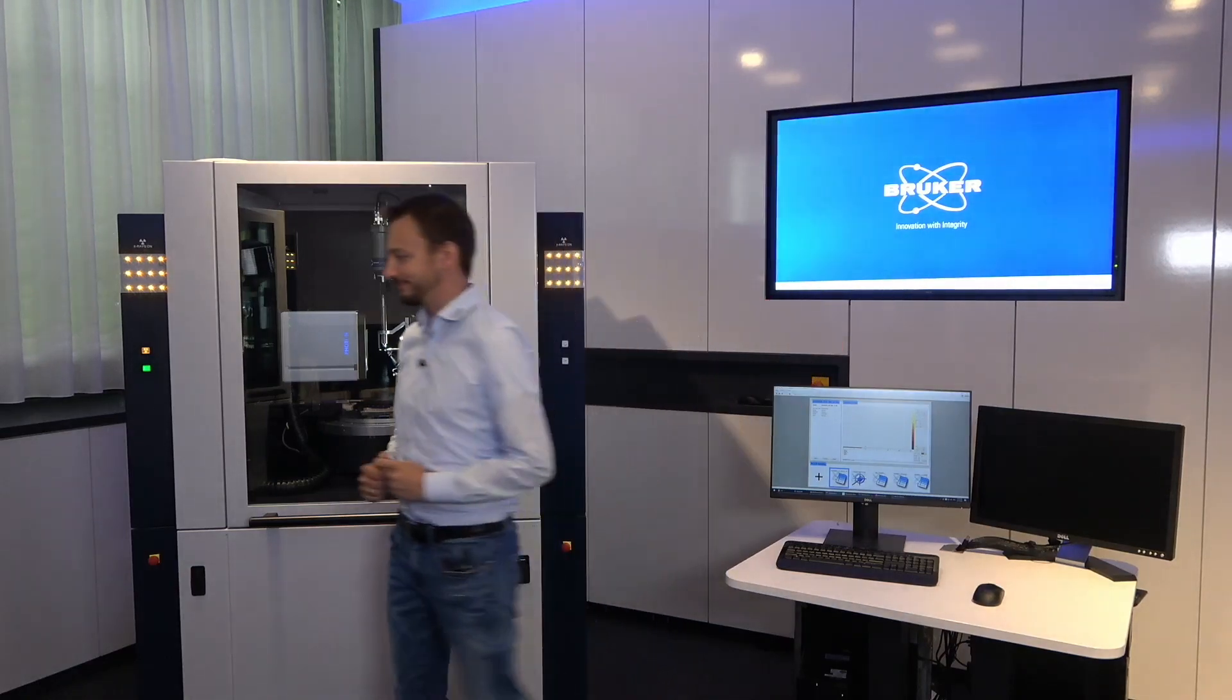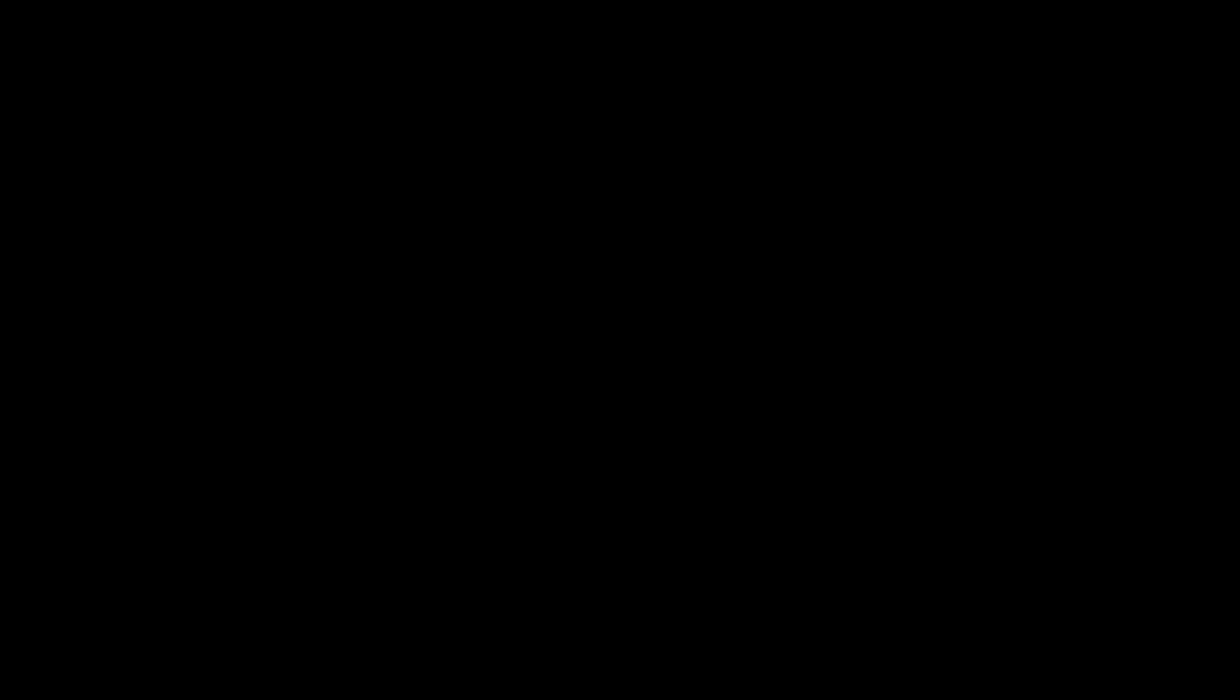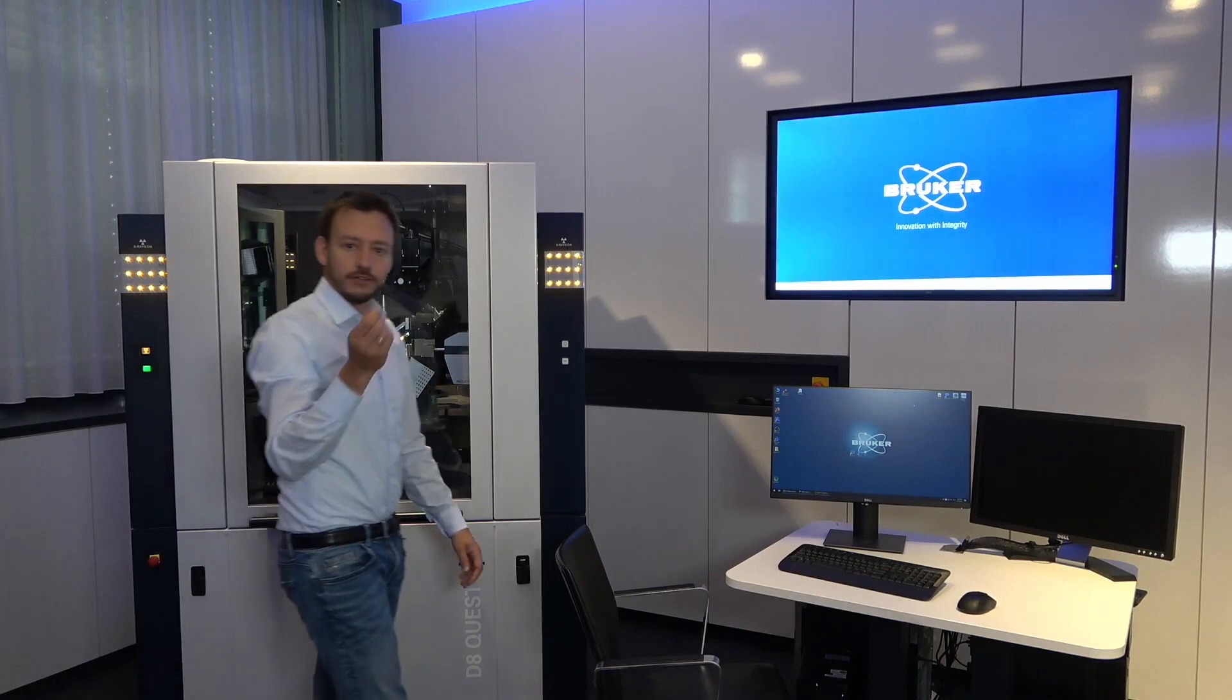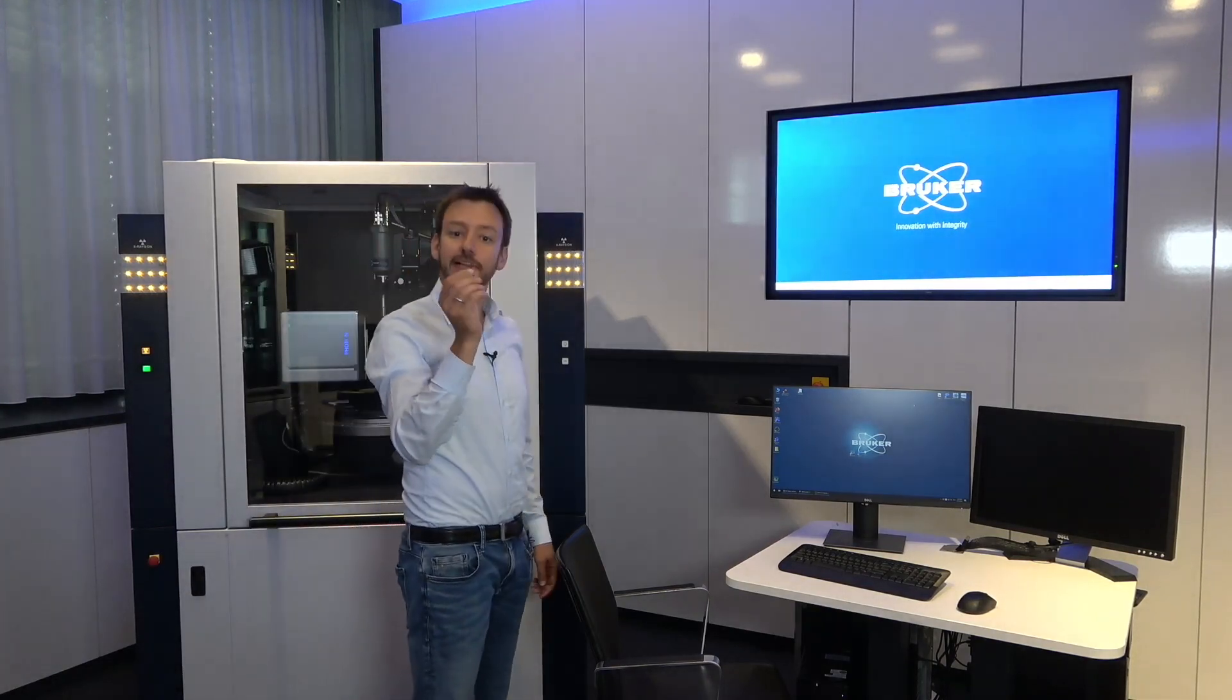Today we will have a look at these nice little blue guys. Let's go and mount a crystal. So here's our crystal, let's mount it on the instrument.